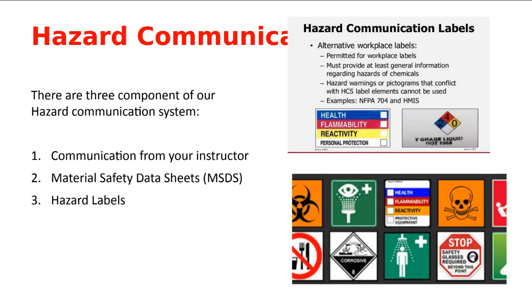The third element is hazard labels, which come in three different forms: a bar label, a diamond label, or a globally harmonized label. People are moving toward globally harmonized labels so that people who don't speak the language of a particular facility or country are all on the same page. I like a combination — either the bar and diamond label plus a globally harmonized label. I won't expect you to know all of them, but I'll show you which ones I want you to know.